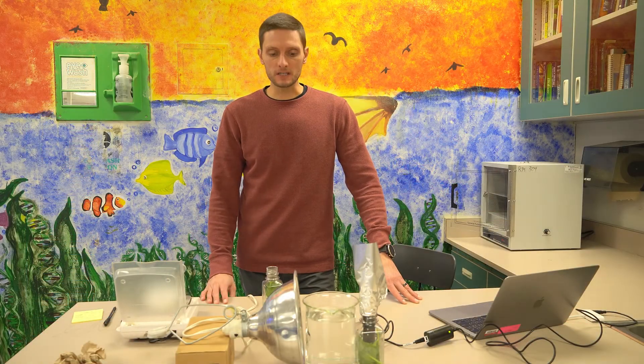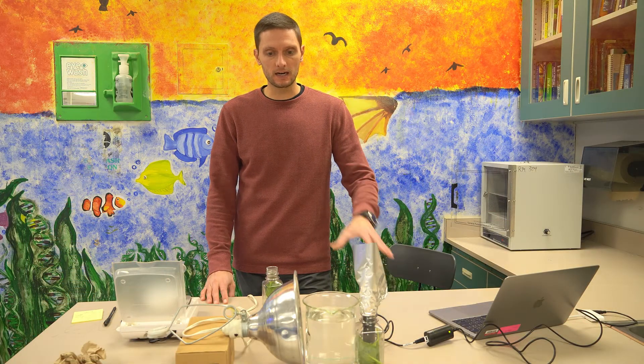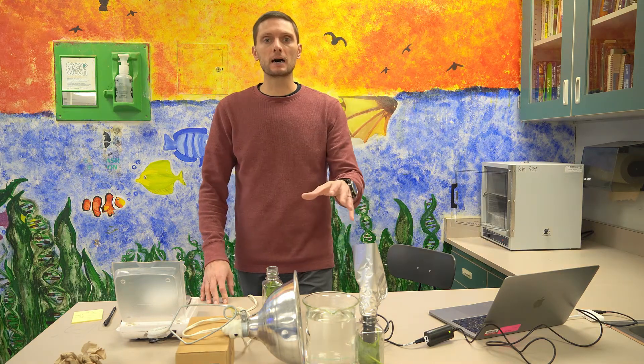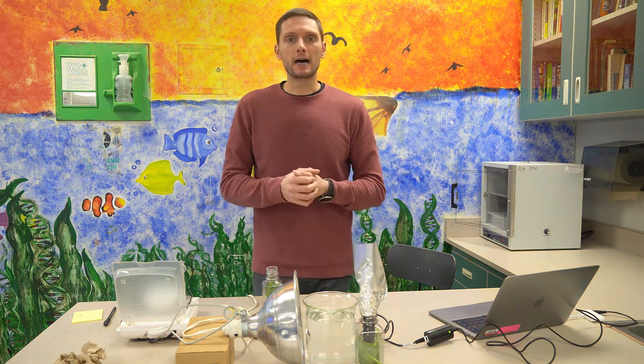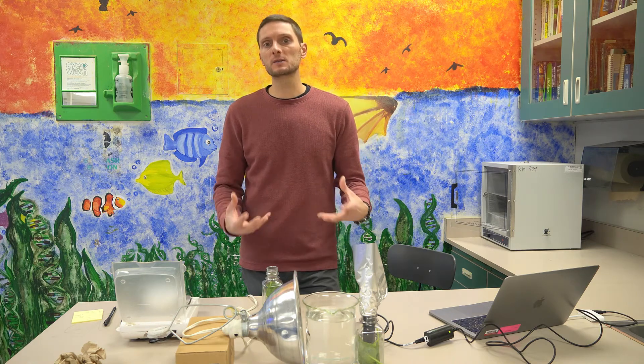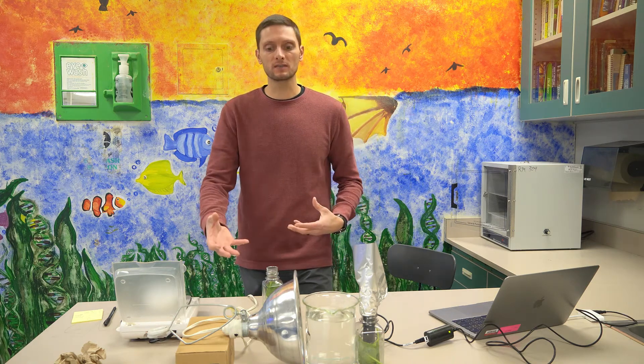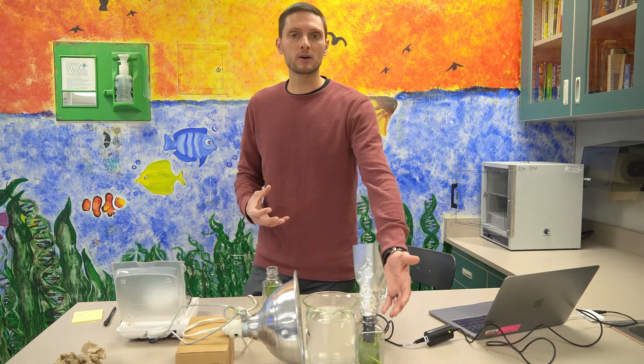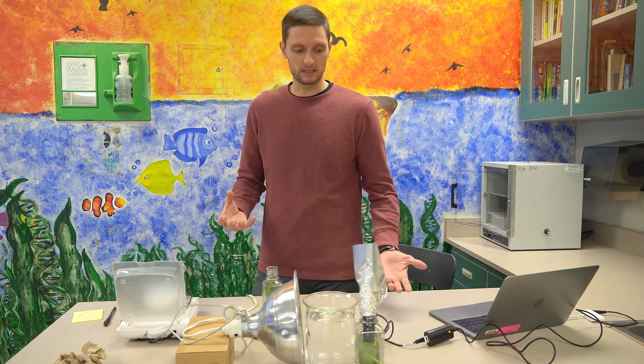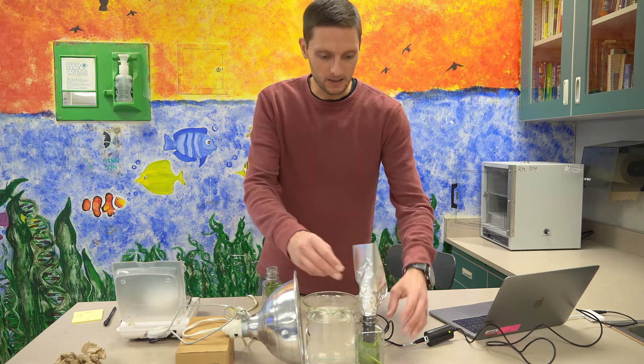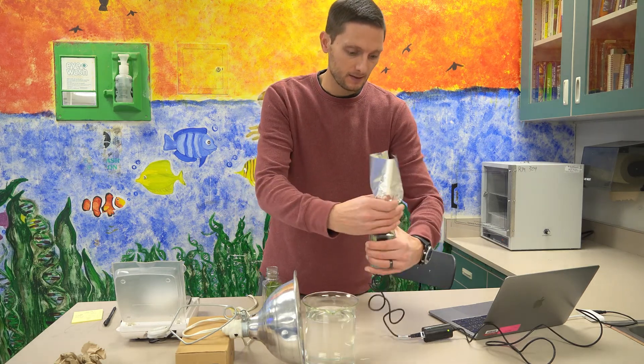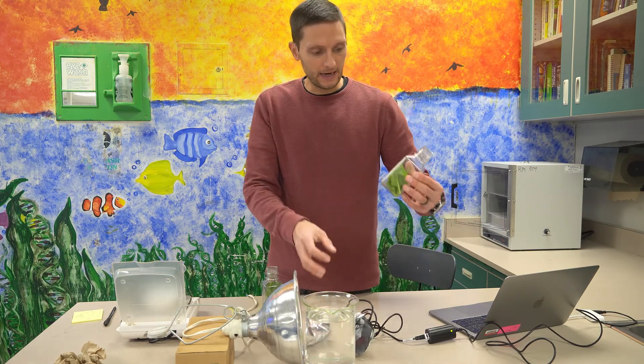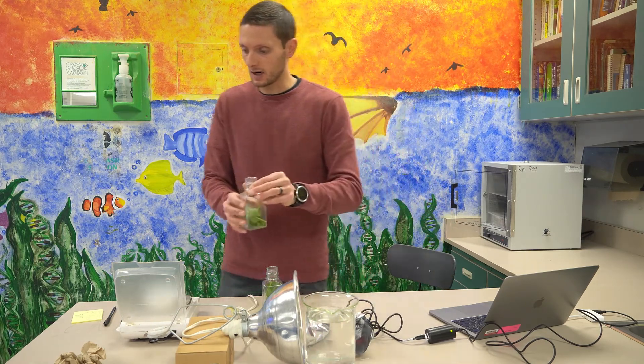Now that our first condition is completed in which we've tested the rate of photosynthesis with the presence of light, we're going to now change our conditions and essentially redo the experiment. But instead of the presence of light, we're going to actually cover our biochamber so that it has no light present. And so what I'm going to do is I'll remove the CO2 gas sensor probe and I'm going to discard this spinach.